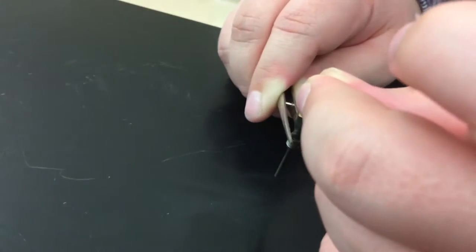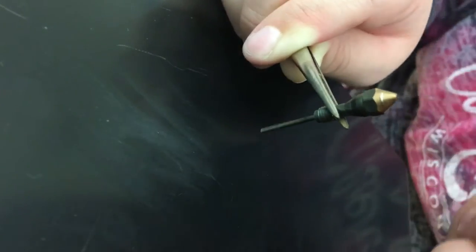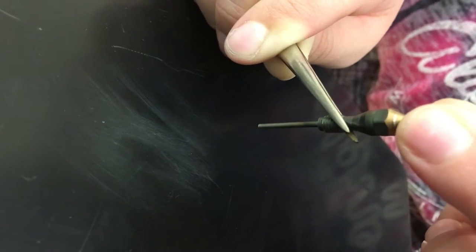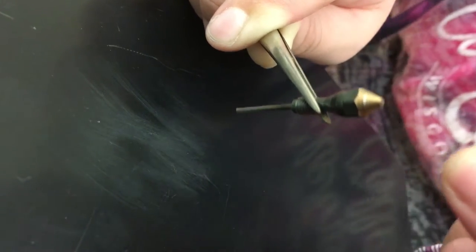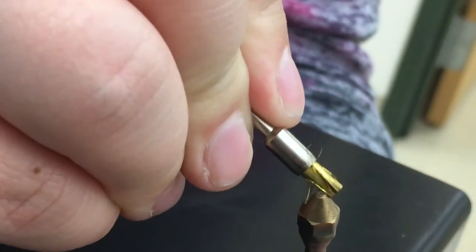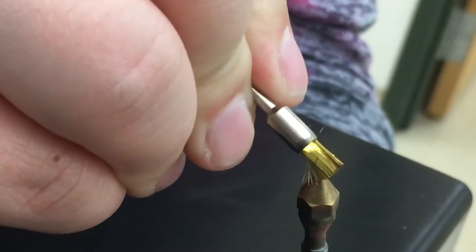Using your HP cleaning kit, a small wire is going to be placed inside the tip of the jet to remove any loose particles. Next, take the brush provided from your HP FID cleaning kit and brush the jet tip.